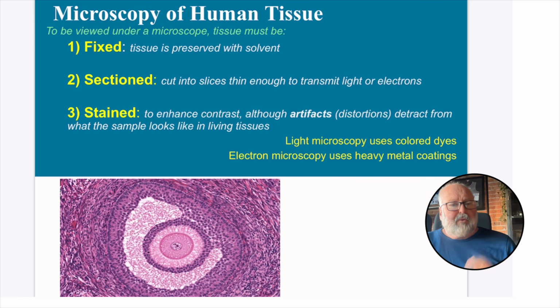Most tissues will be. So we have to go through a long, multi-day process of slowly removing the water and replacing it with alcohol. Then the alcohol gets displaced by a series of baths with wax in them, with more wax in each bath. Slowly that puts the wax in and makes a solid chunk that the tissue is now embedded in. Now, why do we do it slowly? Because we don't want to rush the process, or else cells will shrink and the tissue will distort. So we do it very carefully so we can retain the same look.